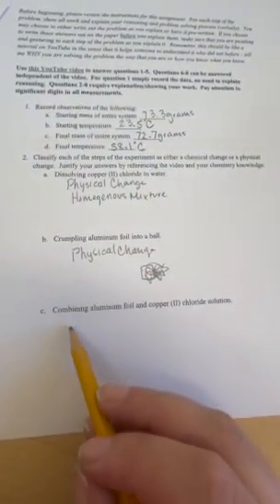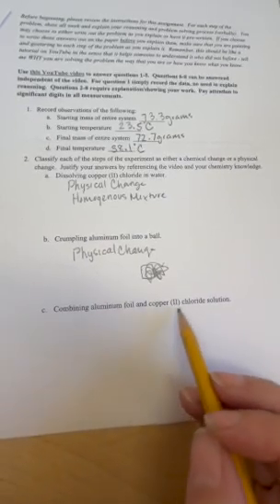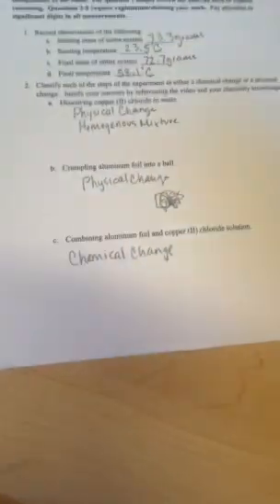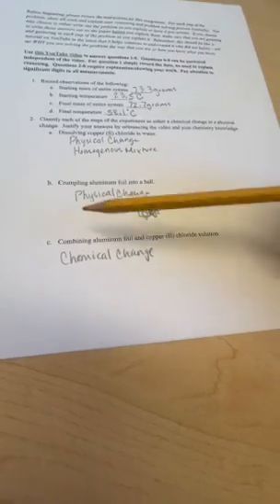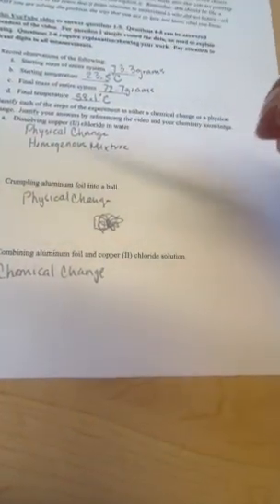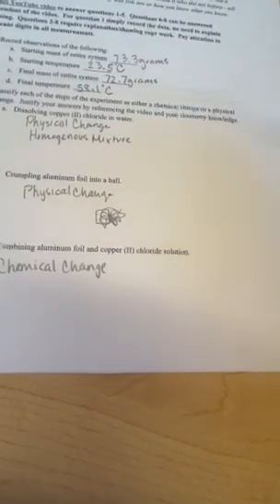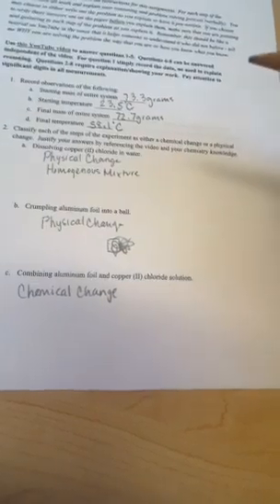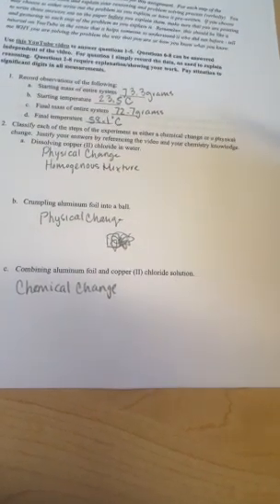On this third one here, combining the aluminum foil and the copper chloride solution that we made up here, and number one, this is going to be our chemical change. The reason that this is a chemical change is that we observed quite a bit of reactivity. The foil, when we first put it in, started to dissolve into that copper chloride solution.